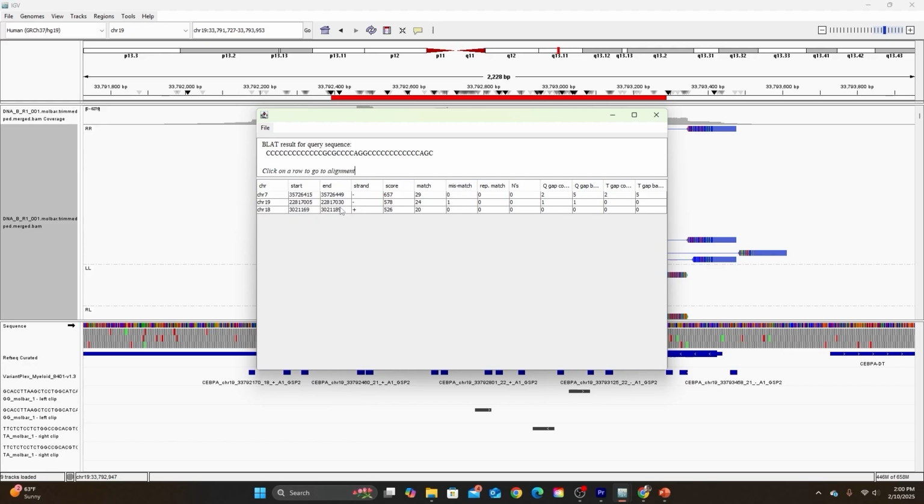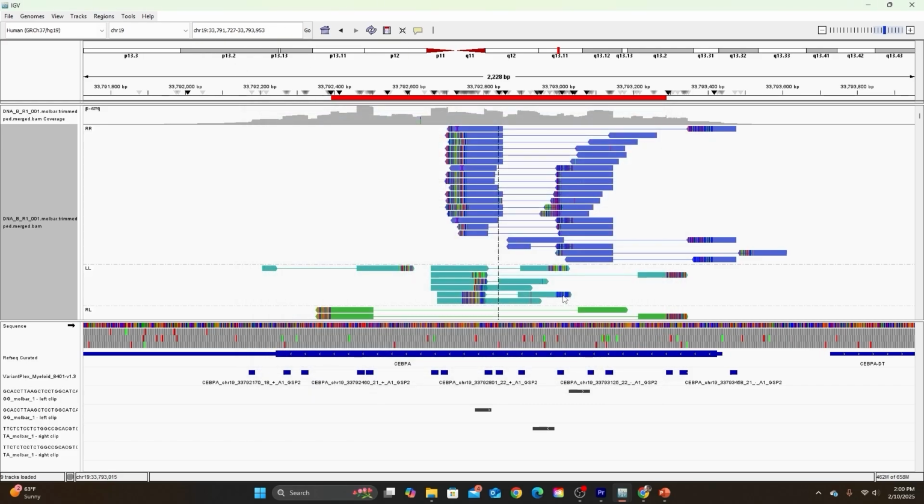It's chromosome 19. It's not the first hit. It's actually not in the range of where we're looking right now. So these map to somewhere totally different from where we're looking. So they don't really provide a clue as to what's going on here. When that happens, it's hard to know how to interpret that. If it's not the main story, it's best to just ignore it.